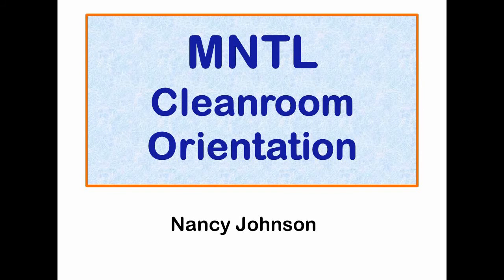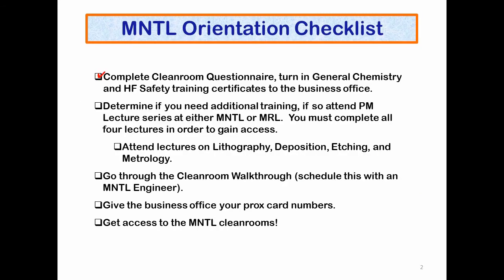My name is Dr. Nancy Johnson. I'm the Principal Research Engineer for the facility, as well as the Cleanroom Manager. There is a process involved in getting approval to work in the cleanroom. We have a checklist that everyone must go through.